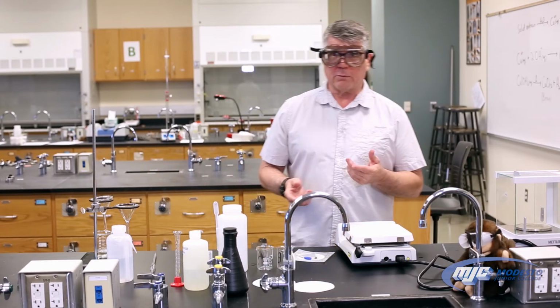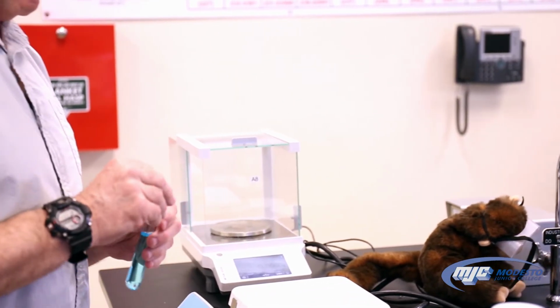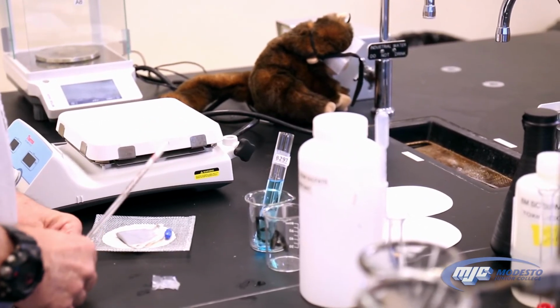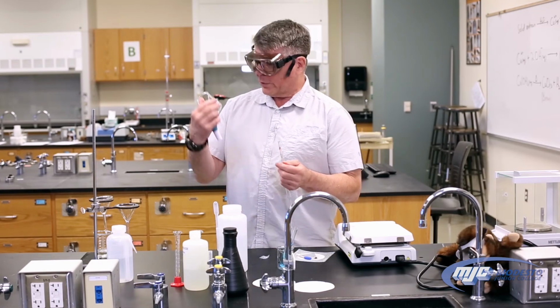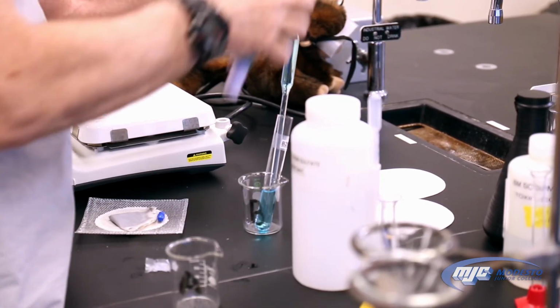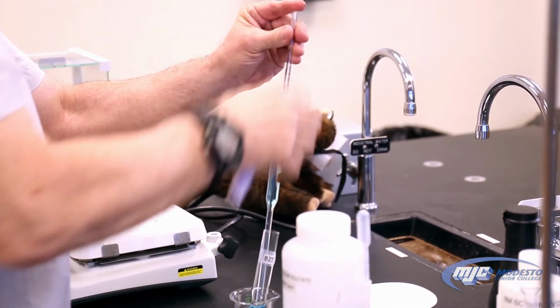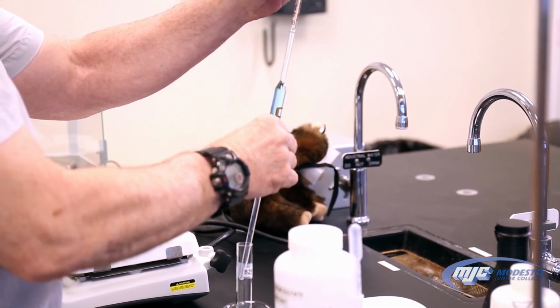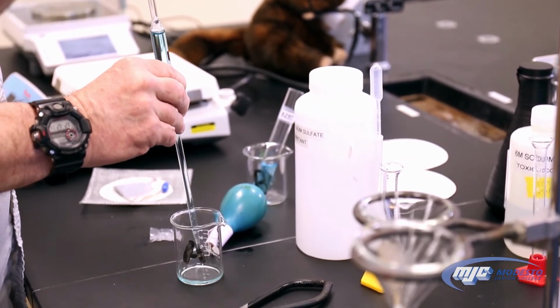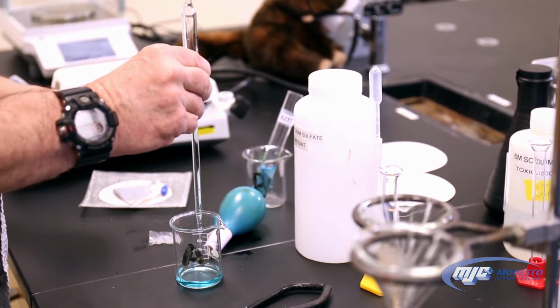So part B, that's your unknown solution. So you get it in a tube. First thing we're gonna do, guys, is use a volumetric pipette. Pipette 10 mils out into a 100 milliliter beaker. So that's our volume for our molarity calculations, 10.00 milliliters or 0.01000 liters.